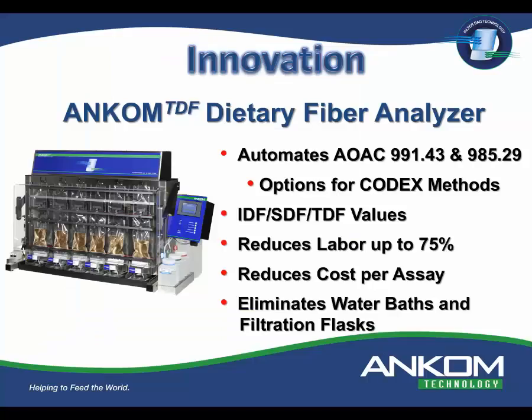Okay, Chris, thanks. So for those who maybe this is your first webinar and you're not real familiar, here is an image of the instrument, and here is how the bags are set up on here. And basically, this is what we talk about when we see the dual chamber filter bag. There's bars here that block what would be the beaker from the gooch, and they're attached basically to each other. So that's what we talked about.